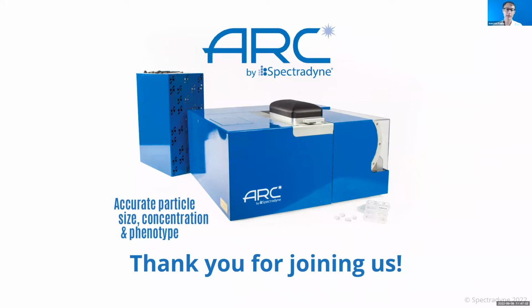Thank you, Michael. That's an excellent question, and I'd love to answer it because one thing that's very special about this technology is that we are gating on only real particles that are detectable by MRPS. Many fluorochromes may aggregate into very bright particles that would show up as bright fluorescence events on a flow cytometer, for example.